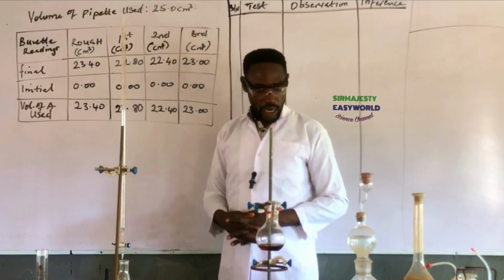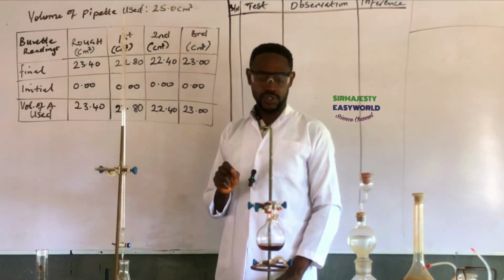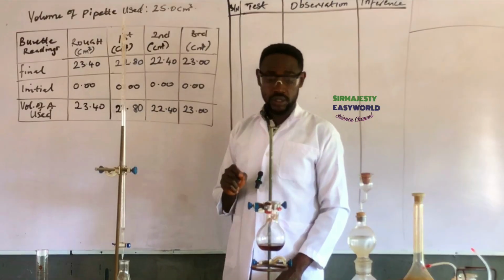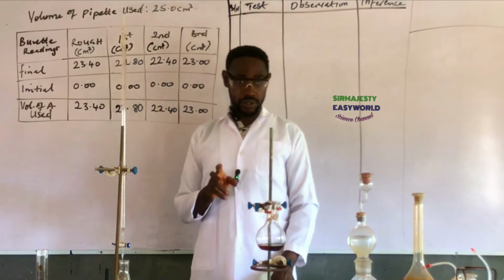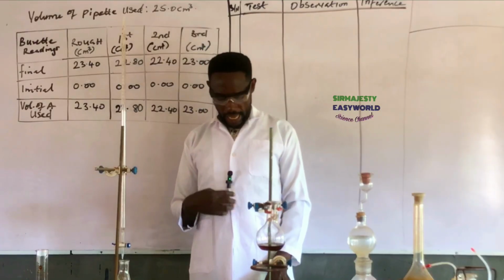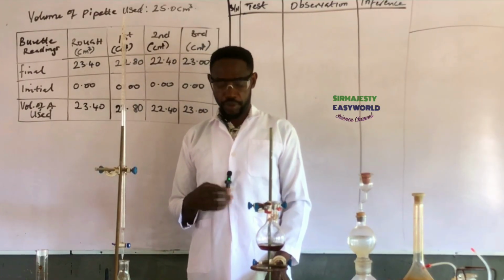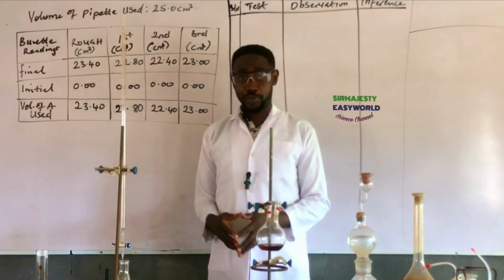Now, the way to manipulate your table, if your teacher gives you the endpoint. Your teacher is supposed not to divulge it for you. Of course, I don't give it to my students, because I train them very, very well so that they become perfect in the process.